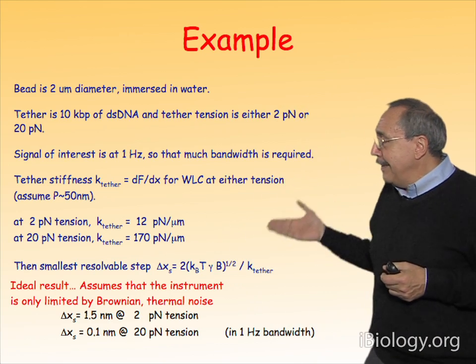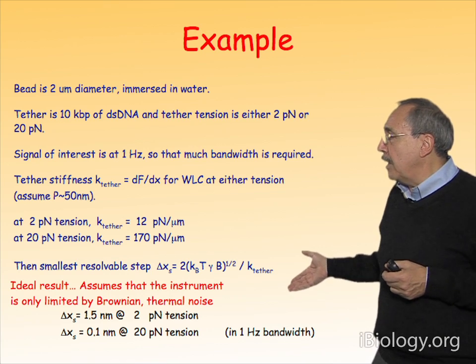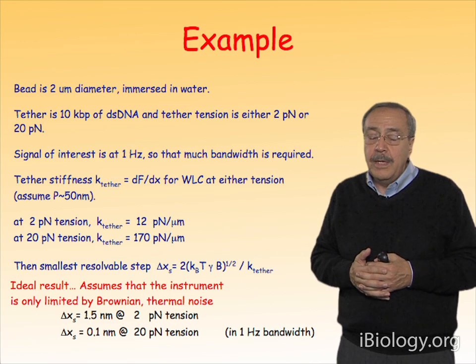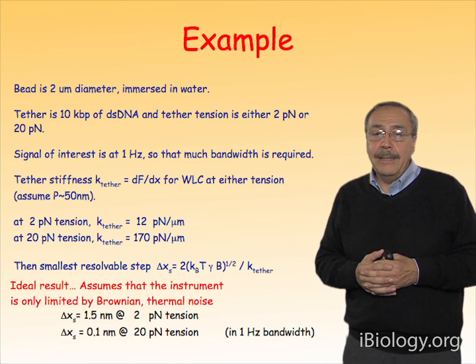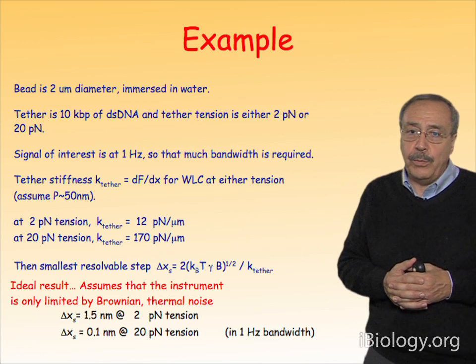Of course, this is somewhat of an ideal result because it assumes that the instrument is only limited by Brownian noise, thermal noise, and that is an important consideration with which we should end.